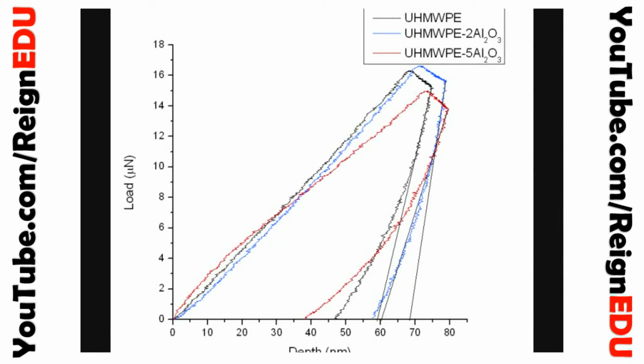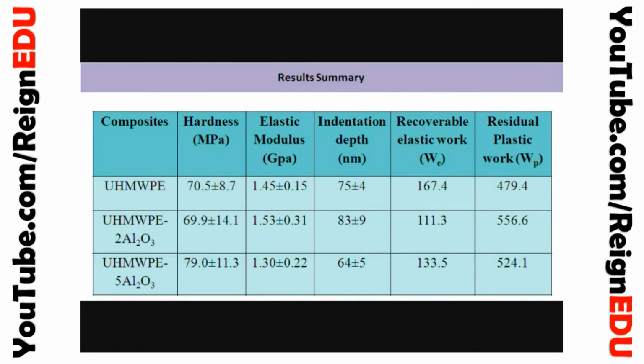It is seen that the residual depth is least in the case of ultra-high molecular weight polyethylene plus 5 weight % alumina, while greatest in the case of ultra-high molecular weight polyethylene plus 2 weight % alumina. On the basis of this nano indentation curve, a conclusion can be made that 5 weight % alumina increases the hardness of the material up to 79 MPa, and the minimum indentation depth is also around 64 nanometer.